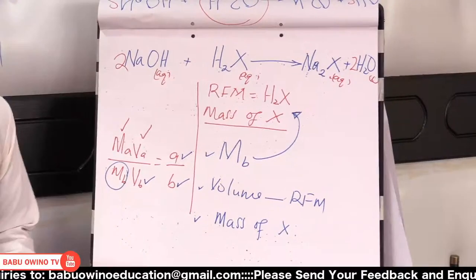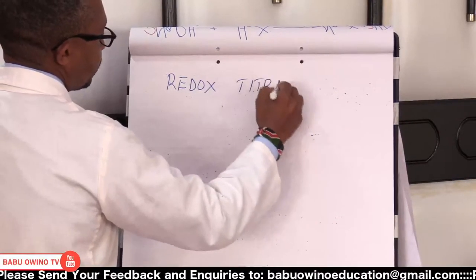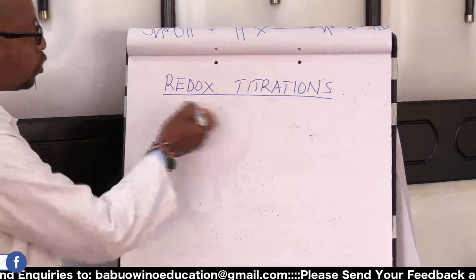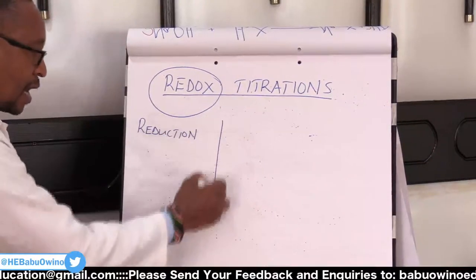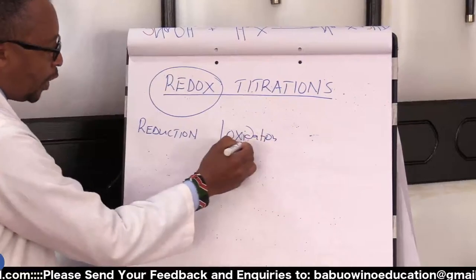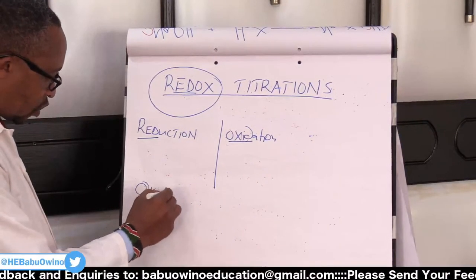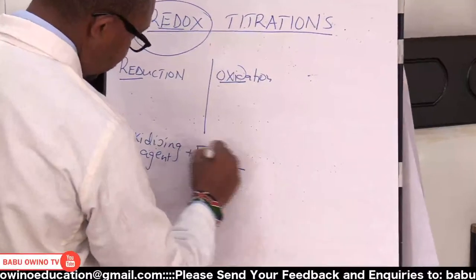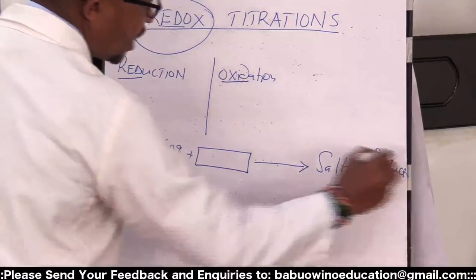Now, from there, we now move on to what we call redox titrations. Redox titrations. With redox titrations, this is simply a name to confuse you. This is a combination of two words, reduction and oxidation. When we combine this, we get redox. So we get a strong oxidizing agent. A strong oxidizing agent. And we react it with another substance. And in this case, we'll get a salt plus other products, depending on the oxidizing agent in question.